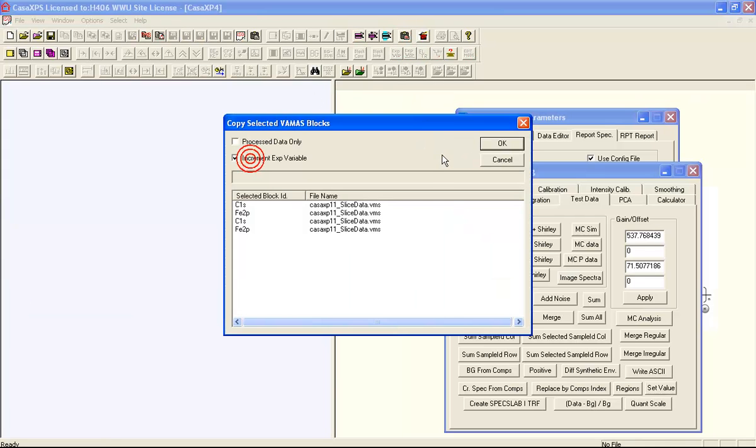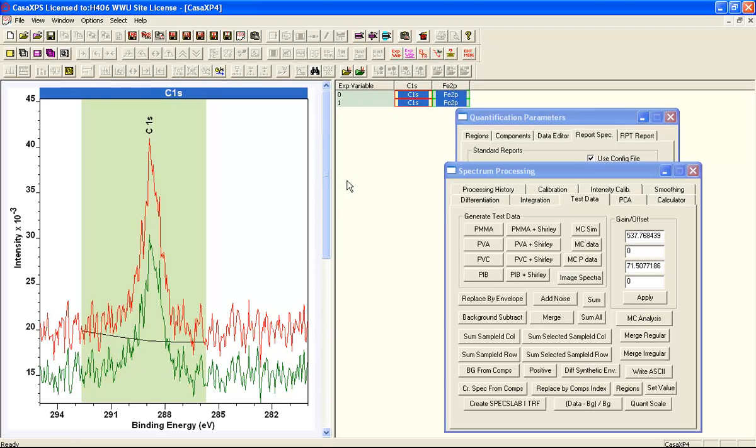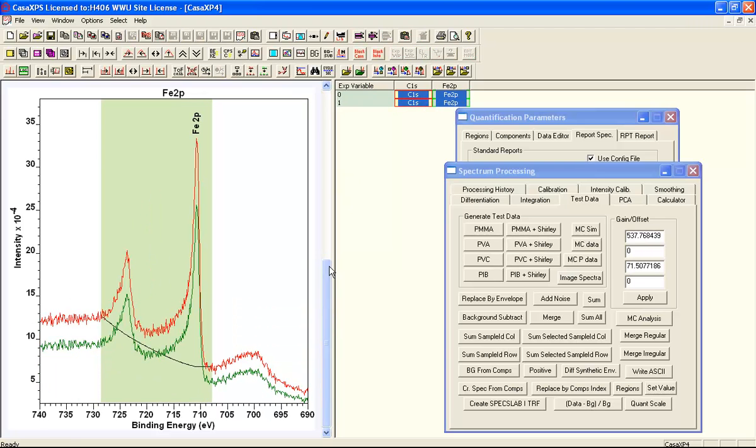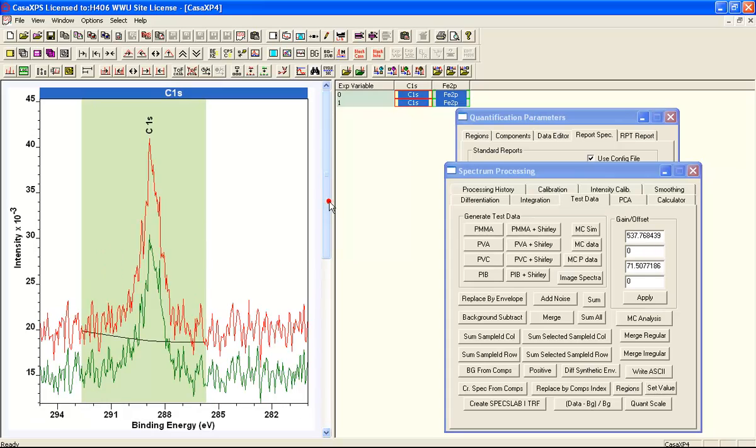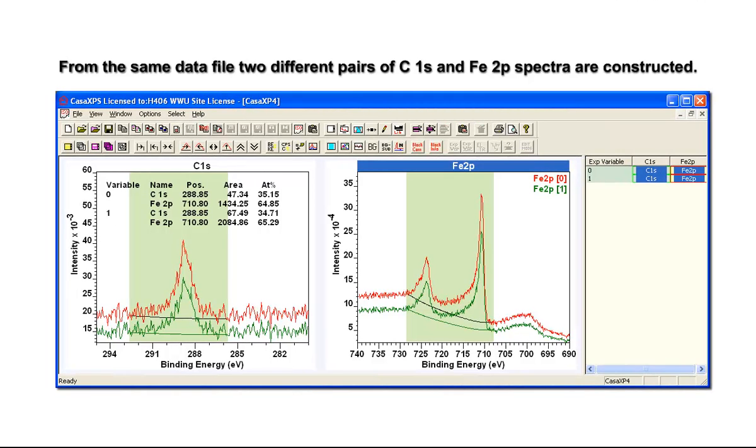Let's copy these into a file and verify that we really have come up with different spectra based on the detectors that were included in the final form of these carbon 1s and iron 2p spectra.